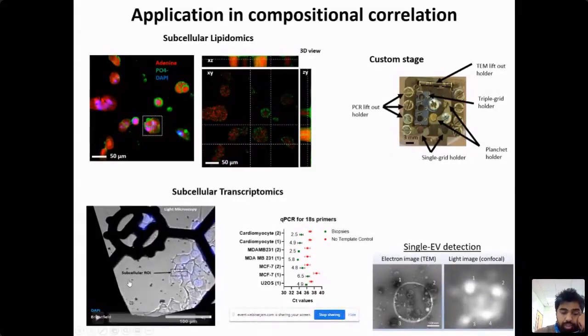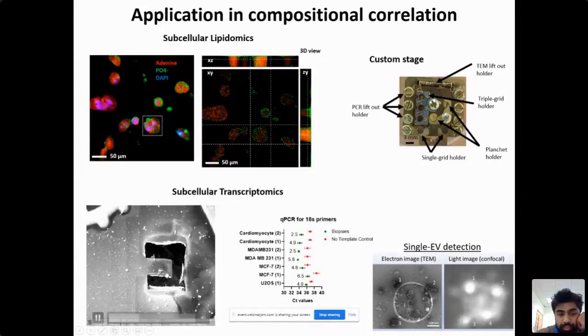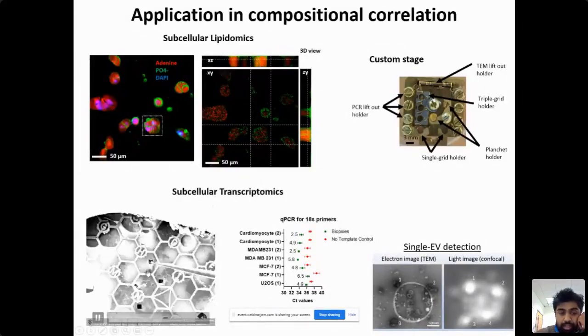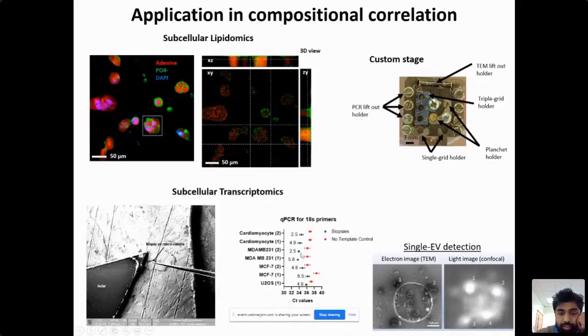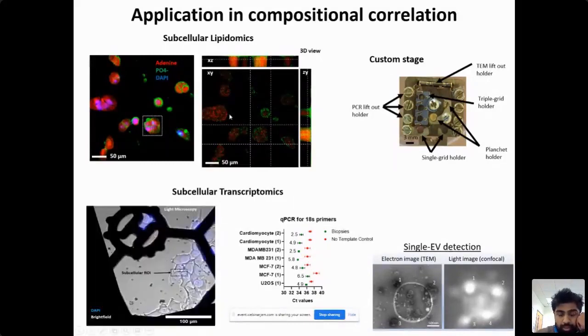And to look at gene analysis, such as transcriptomics, I developed another method, and cryo-confocal was central to this platform. So basically what I did was to relocate subcellular regions of interest using fluorescence in a cryo-focused ion beam microscope. And precisely here, shown in sub-micron 3D scale, I was able to isolate subcellular regions and then transfer them to a PCR tube, and then get microscale transcriptomic information. Both of these instruments can go up to sub-nanoscale, so it's just a matter of time when we can understand the 3D molecular arrangements of genes within cellular compartments.